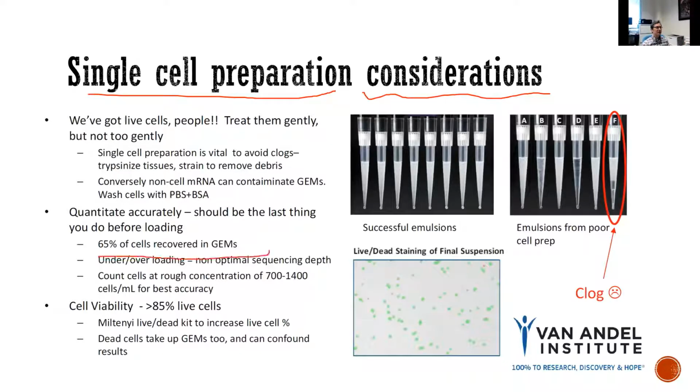If you have a target number of cells, for example, you aim to sequence at least 5,000 cells, you may want to aim a little bit higher, say 7,000. Then after your experiment, you eventually get 5,000 individual cells' information. So there are technical considerations, but you have a lot of references and protocols you can look at. Some tissues will be more difficult to dissociate, but it really depends on which tissue, which cell type you are working on.